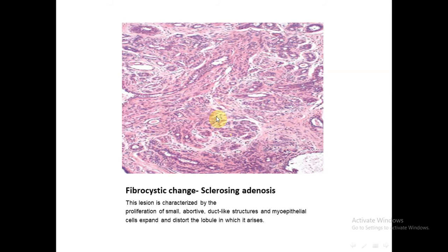Here we have sclerosing adenosis. It is a type of fibrocystic change. First, we see that the lobular architecture is preserved. We see breast lobules and there is a proliferation of multiple small ductules or duct-like structures. These ducts are lined by a single layer of epithelial cells and a layer of myoepithelial cells, which is important for diagnosis of benignity. Here we have the stromal fibrosis, with proliferation of small duct-like structures and fibrous stroma.